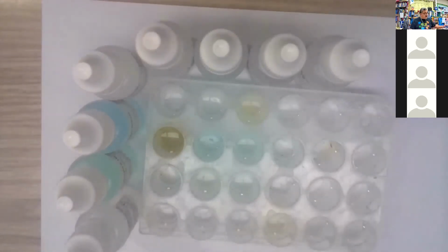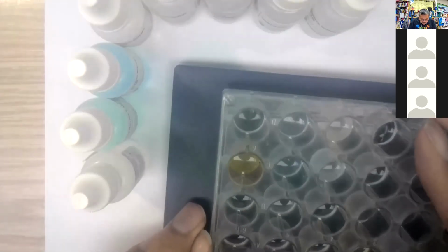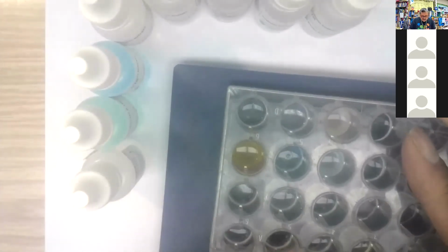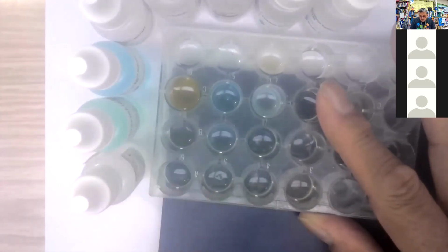Look over here, just looking for powder. Don't see much. How about over here? Looking for a powdery substance, not here. Hard to see, but if any of them were precipitates, I would call it this one right here. Okay, the potassium hydroxide with the zinc nitrate. Oops, you can't see right there. The second one over, 4th row.